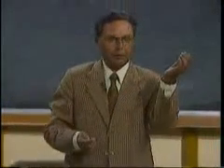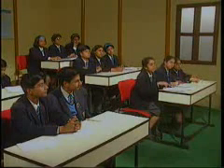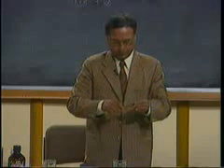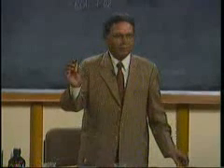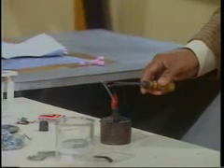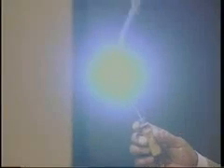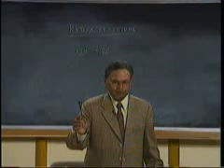Now I'll take the magnesium ribbon, it is with me. The magnesium is a metal. This was a piece of paper and now we have got the metal magnesium. This is just a solid metal. See the burning? What's the color of the light? White.